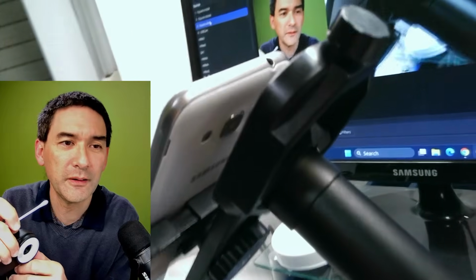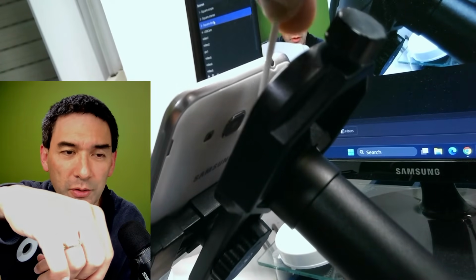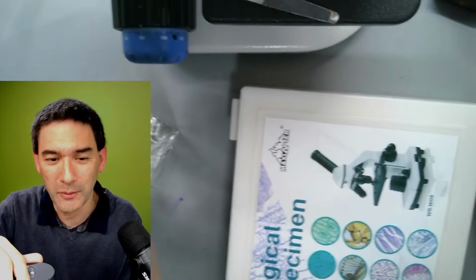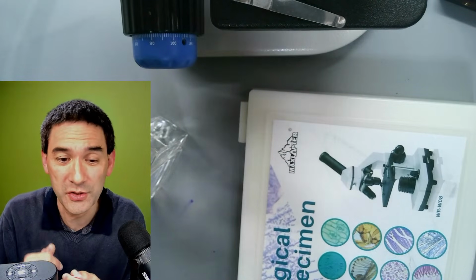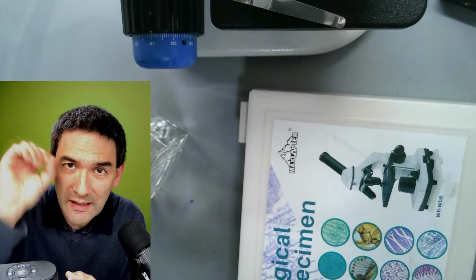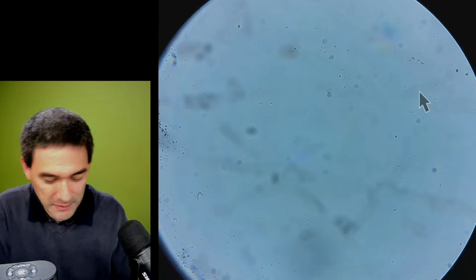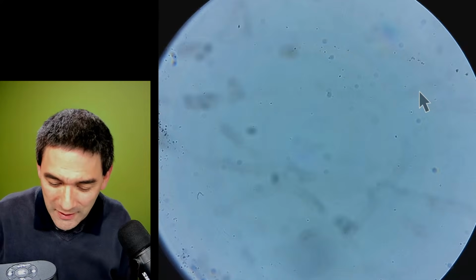Look, you can actually see now. Basically, I went directly on the surface of the eyepiece. You know what it could have been? Even I don't know. It could be because this also happens sometimes when I talk. You spit, and saliva lands on the eyepiece, and then it dries up, and that could have been it. But at least we got that weird paramecium-type looking thing out of the way.